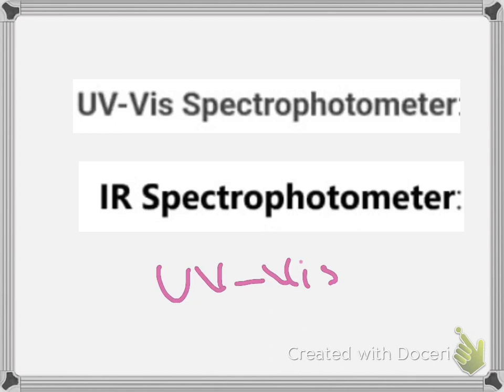It measures the absorbance in the ultraviolet and visible range, so the name is UV visible spectrophotometer.